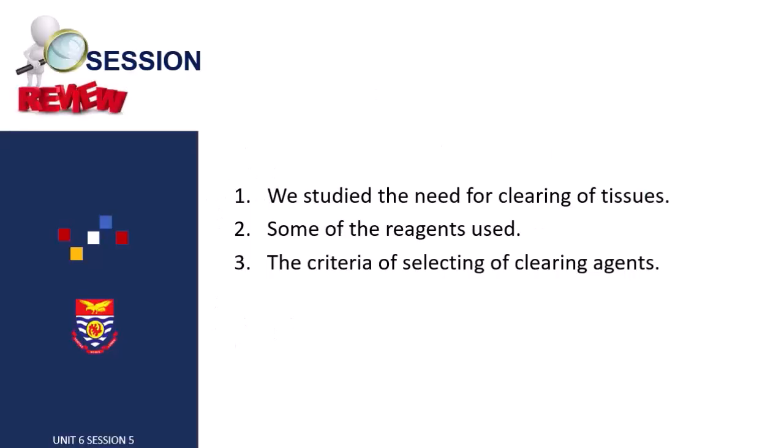This brings us to the end of Section 5 of Unit 6. Under this session, we've studied the need for clearing of tissue in histological studies, some of the reagents that are used as clearing agents, and the criteria for selecting these clearing agents.